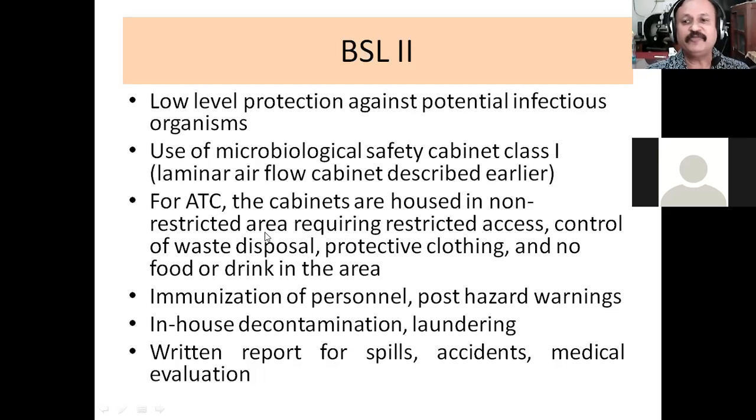So even if the laboratory as such may have different people working together, the laminar airflow system is kept in such a place that not all people will be allowed to go to that particular area. That is called restricted access. Only authorized personnel are going to go near the laminar airflow cabinet and actually use it. Then there is one more thing which is very important: the waste disposal must be controlled.